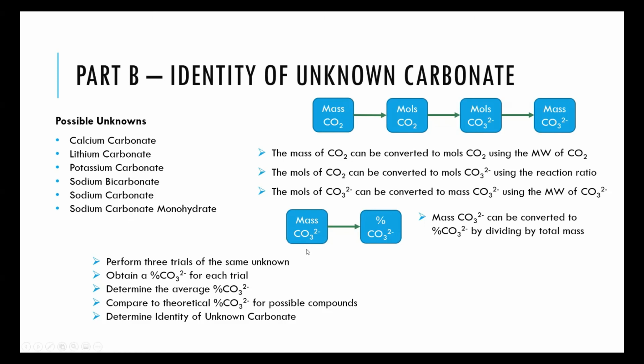So you'll determine the average percent carbonate of your 3 trials that you've determined in lab experimentally, and look to see which one of these possibilities has the closest percent carbonate just based on their molecular formulas and their molecular weights. Whichever compound is closest to your percent carbonate, that is the identity of your unknown.